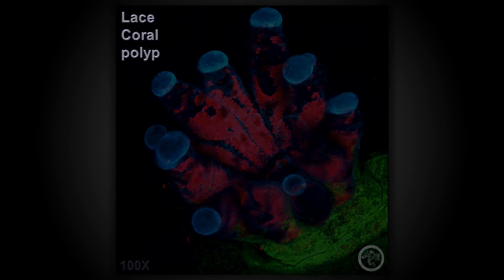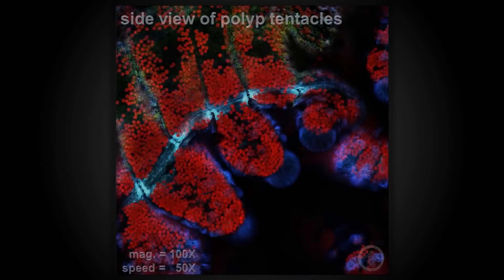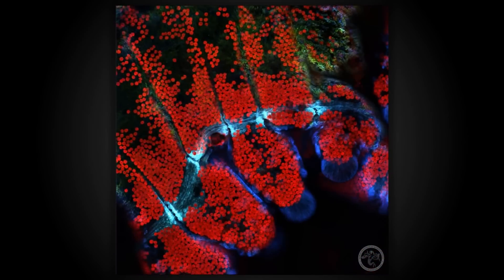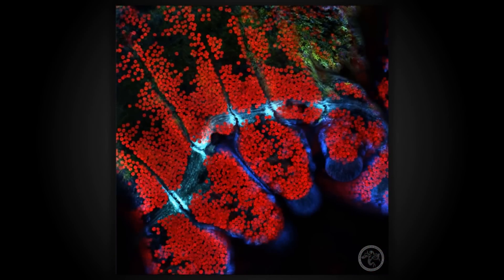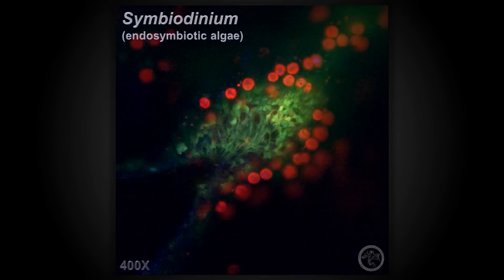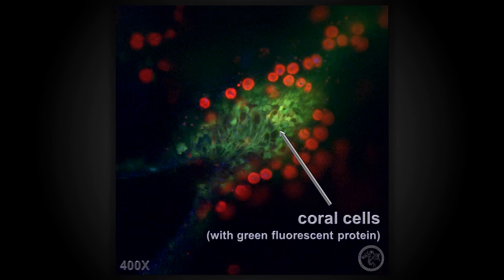Using the confocal microscope also allows us to see inside the coral, such as this view of the lace coral polyp's gastrovascular canal. A side view through this polyp's tentacles shows us the densely packed symbiodinium and bands of tissue that bind the tentacles together. In a close-up view of coral tissue, we can see the arrangement of symbiodinium and the green fluorescence of individual coral cells.